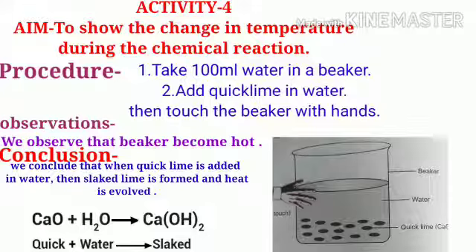How will you proceed with this activity, students? Firstly, take 100 ml of water in a beaker.